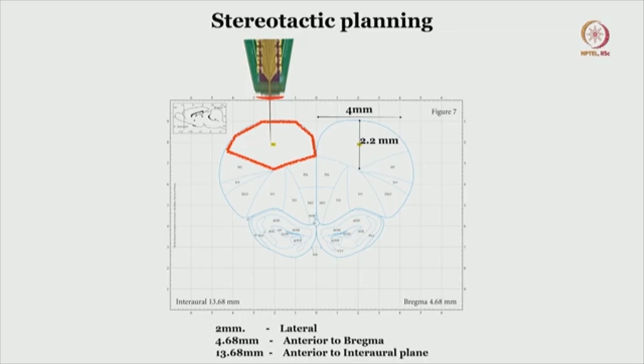If possible, have a dry run without the rat. Especially for all the electrical setup, I suggest a benchtop testing, and checking the electronic apparatus completely before you start the experiment. Apart from that, you need to be ready with the stereotactic coordinates of the structure that you are going to target.